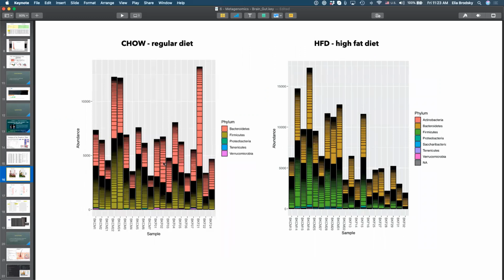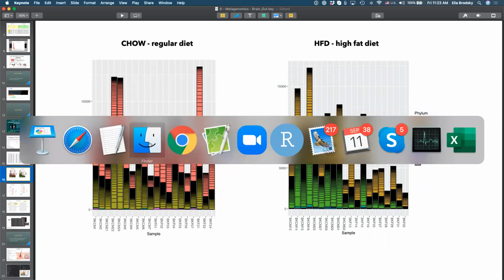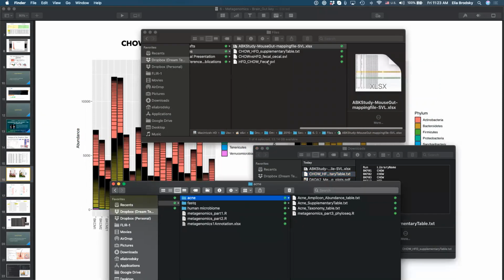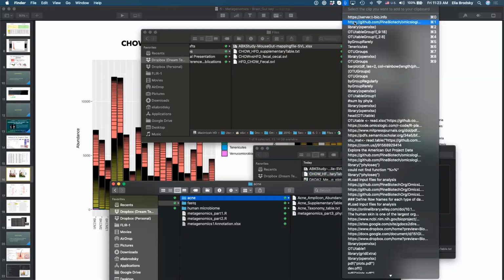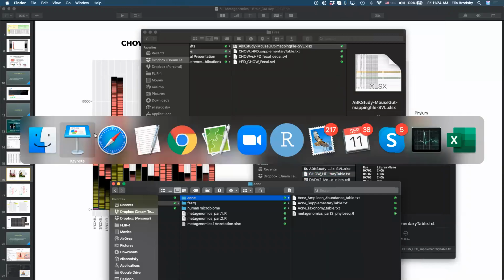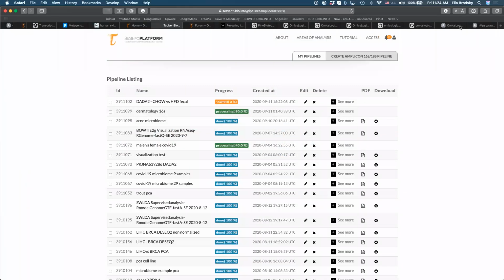So this is, by the way, a different number of samples that I wanted to give you to practice what we did today. The links on GitHub that I gave you earlier are links to files from the same project, but comparing fecal and cecal samples.